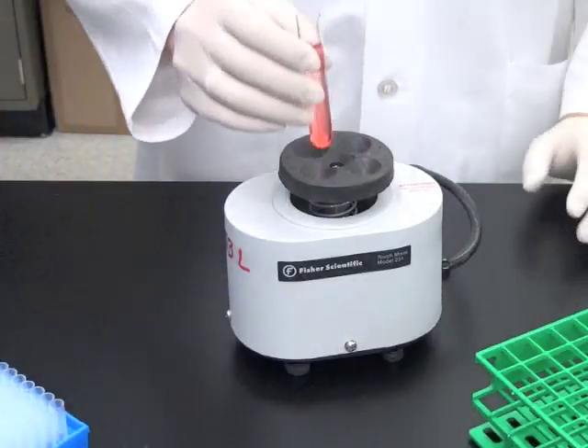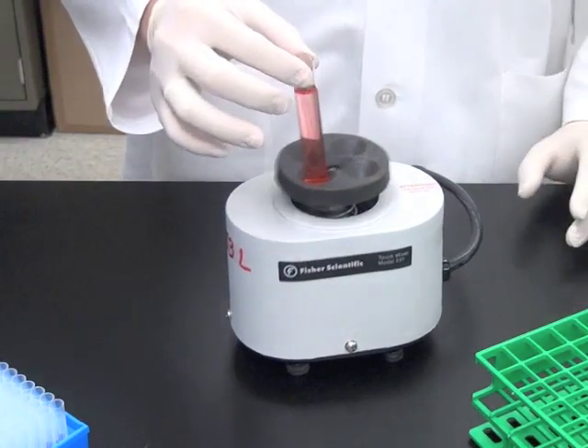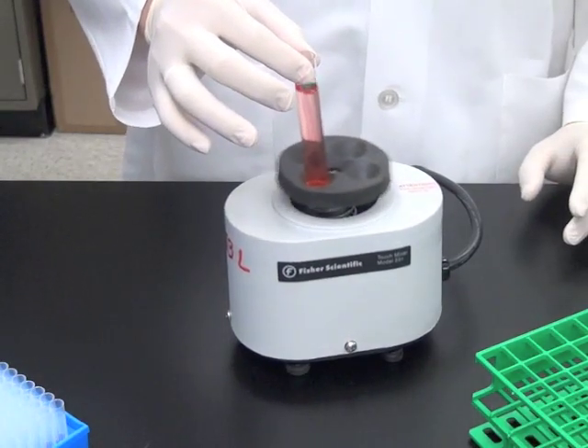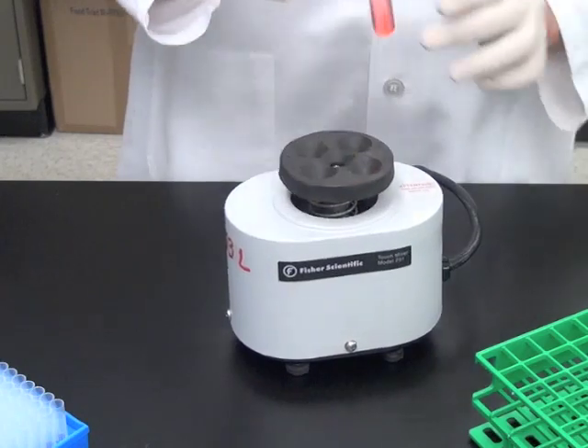When you have solutions with a volume that is more than half the capacity of the tube, you cannot easily use a vortexer, and such use may result in a spill. In this case, you will have to mix by inversion.